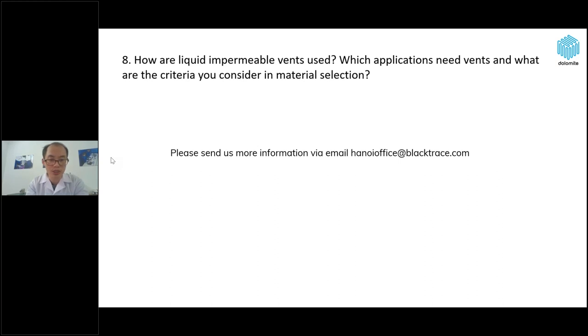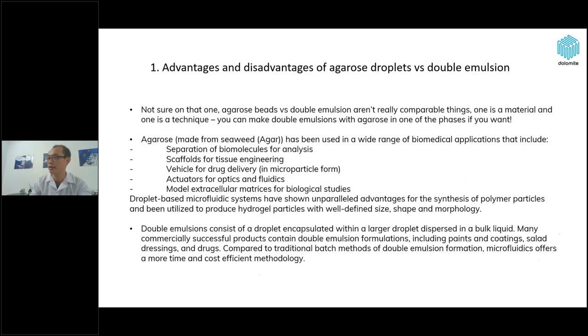Okay, I got another question: does a higher flow rate ratio value give a smaller or bigger size of the lipid nanoparticle? Actually, with a higher flow rate ratio, you can obtain a smaller size of lipid nanoparticle. Let me move to the slide.